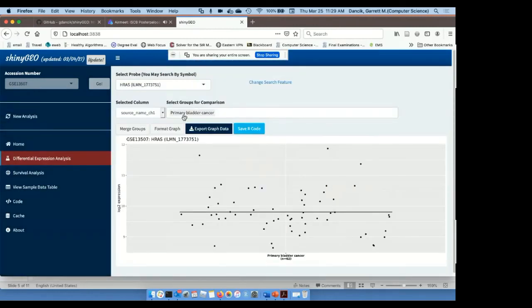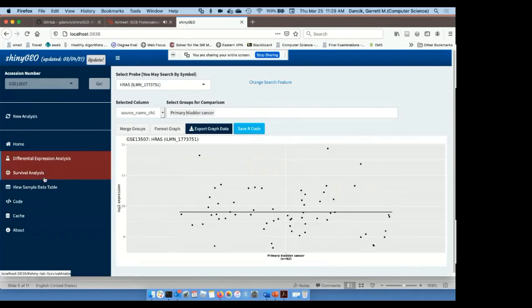When I do that, the previous graph is going to update because now we don't have any normal samples. So it's just showing us the bladder cancer samples.